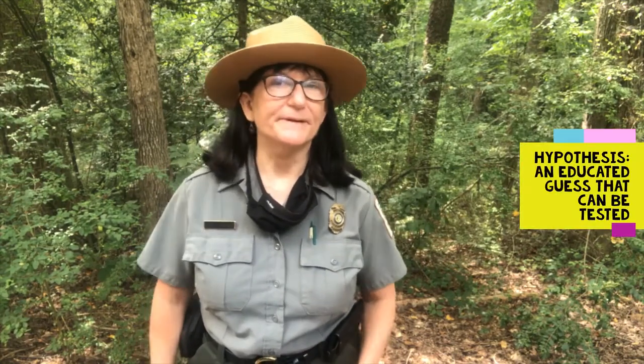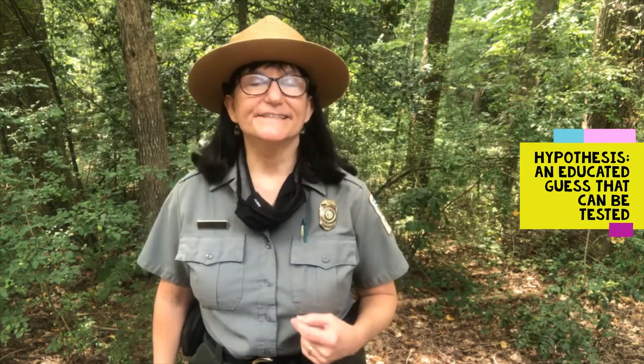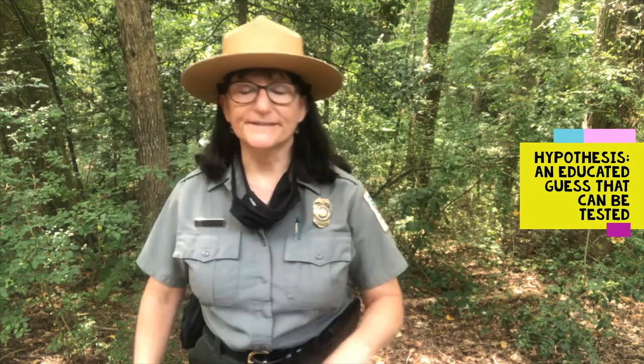Well, we're scientists, and scientists have tools to use. We can ask questions, that's a tool, and we can make hypothesis statements based on what we do know about these liquids. So, a hypothesis is an educated guess that can be tested. So let's look at these liquids.